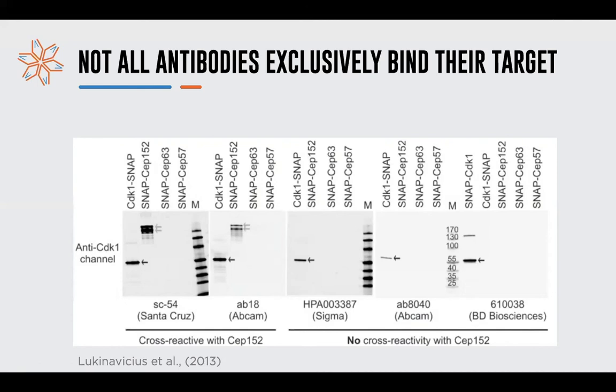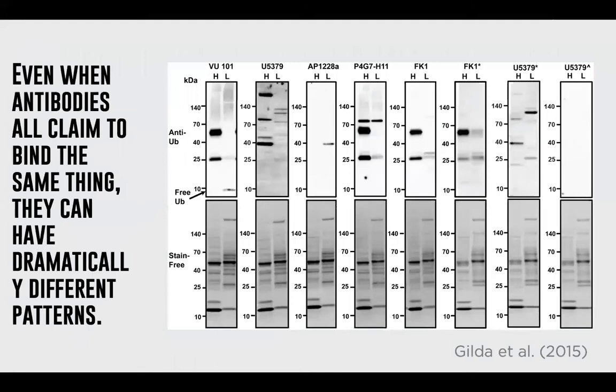And you can't even necessarily always trust just a single vendor to do everything. In both camps, we've got Abcam. So there's no good and reliable way to actually determine, is this going to be a good antibody or a bad antibody? And this isn't a cherry-picked example. These specific antibodies have been referenced in over 200 papers.